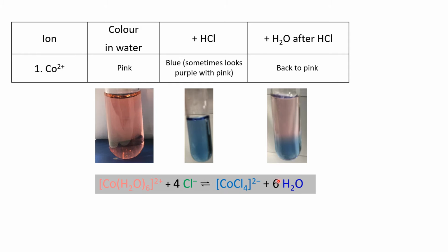However, now I take this new equilibrium that's over on this side and I add water. Well, here I'm adding something on the right. I'm adding a product. What does that do to the equilibrium? It pushes it back to the left, so the blue goes to the pink. So a really lovely equilibrium, lovely illustration of Le Chatelier's principle. And so there we are, writing it all out.